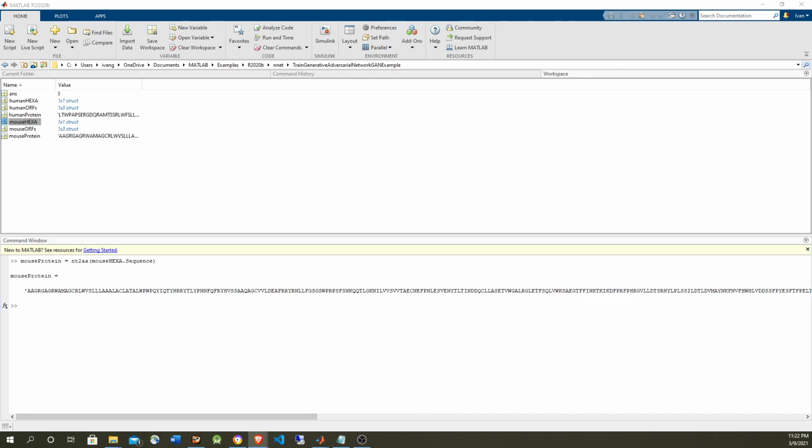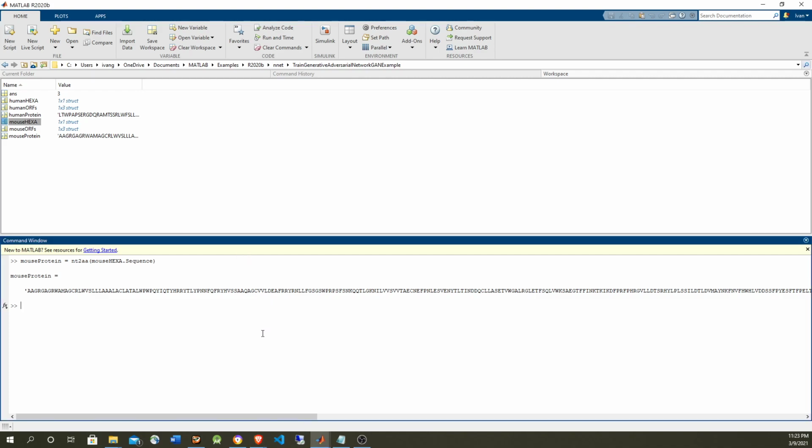Now let's compare the human protein with the mouse protein, and we're gonna do it with this function. Before going there, this is the mouse protein, the human protein, and this is the window and the number of characters within the window that should match in order to get a match. So this could be visualized better like this.